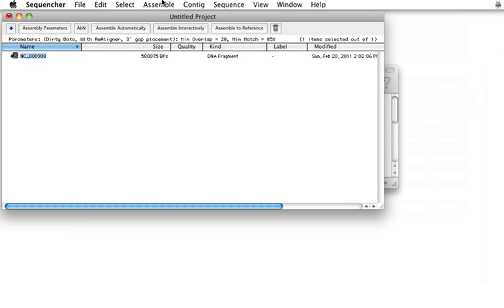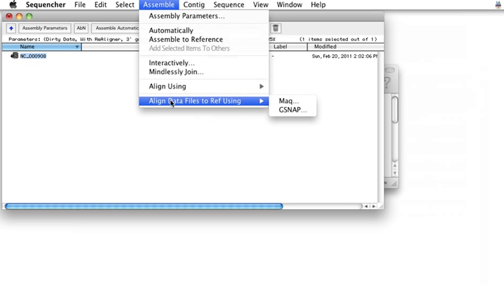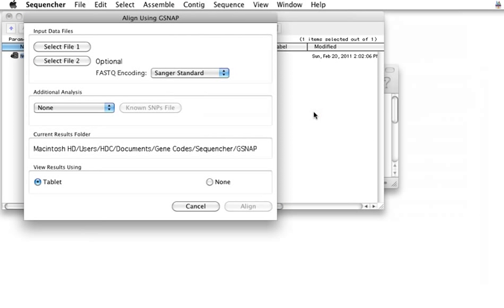I take that, and I'm going to say, align data files to reference using, in this case, I'm going to use G-Snap, a program developed by Tom Wu and collaborators at Genentech. We can choose to use either single read or paired-end reads. I'll use paired-end reads in this case.